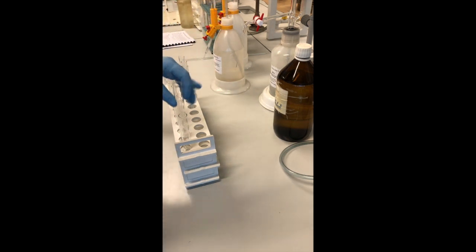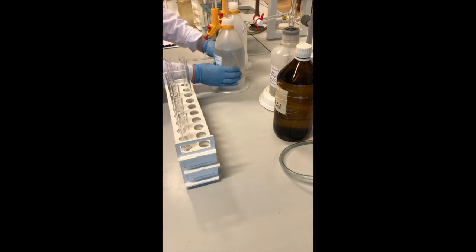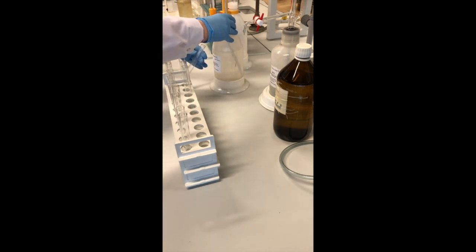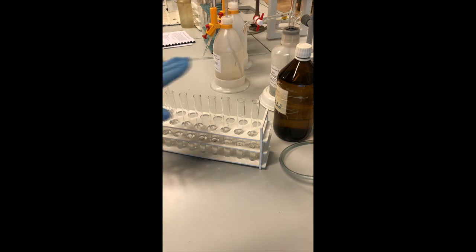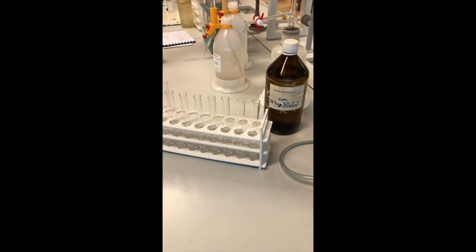So here is 4.9. Now we will add to 0 again. And the first tube is 4.8. And so on. So now you have in the tubes the standard solution and the absorbing solution.